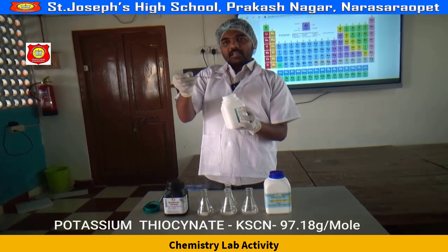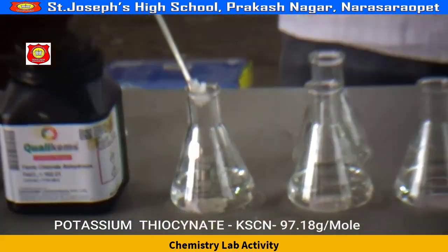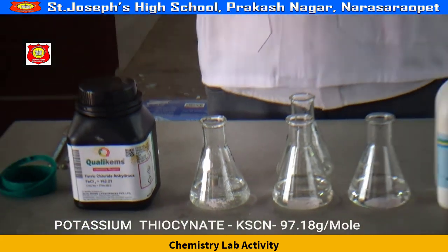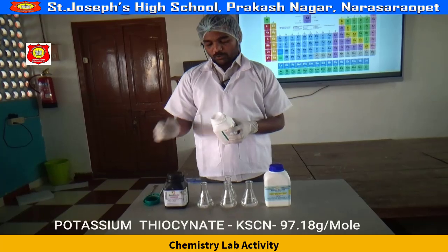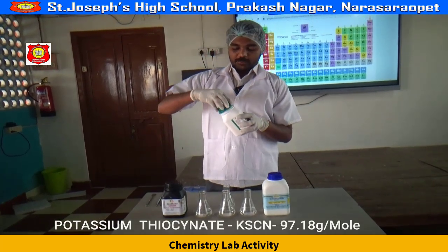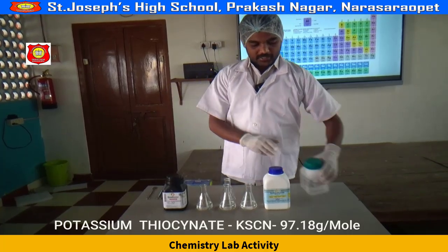Now see this, I am taking potassium thiocyanate into a conical flask containing 50 ml distilled water. After that, we have to keep the spatula down. This is the rule that everyone has to follow. After adding the potassium thiocyanate into the conical flask, we have to keep it aside.